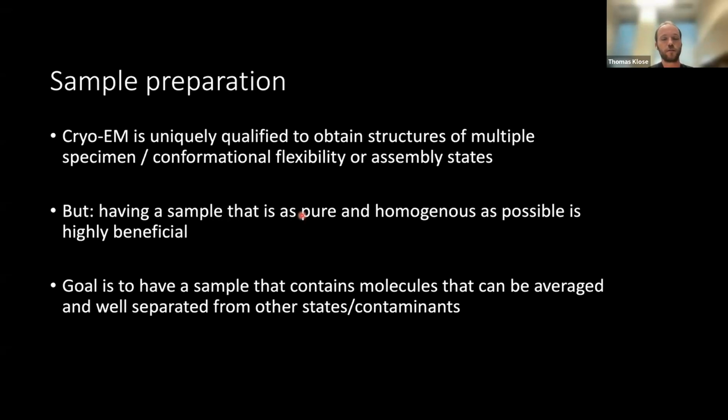While there have been some research projects that just take a cell extract and then try to get a structure from this, that works kind of okay with ribosomes because they're very abundant in cells, but probably not with other molecules at this point.